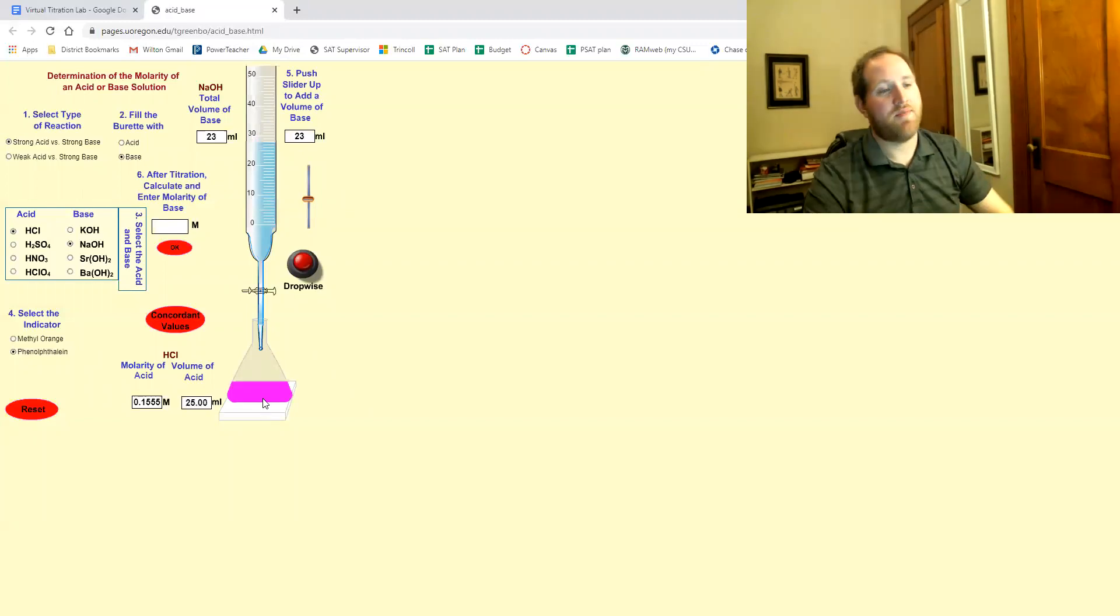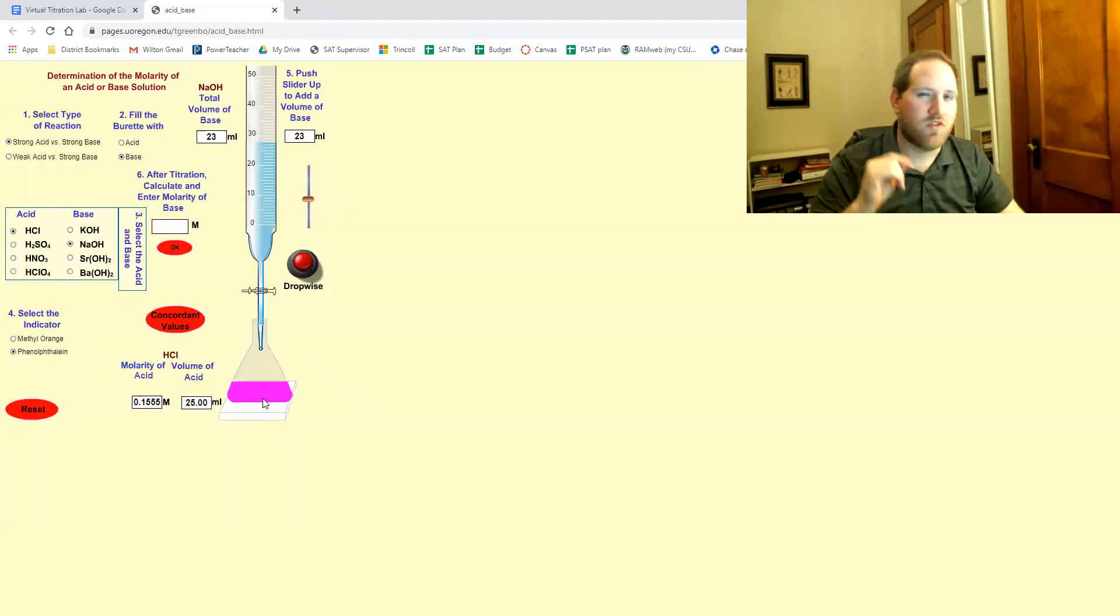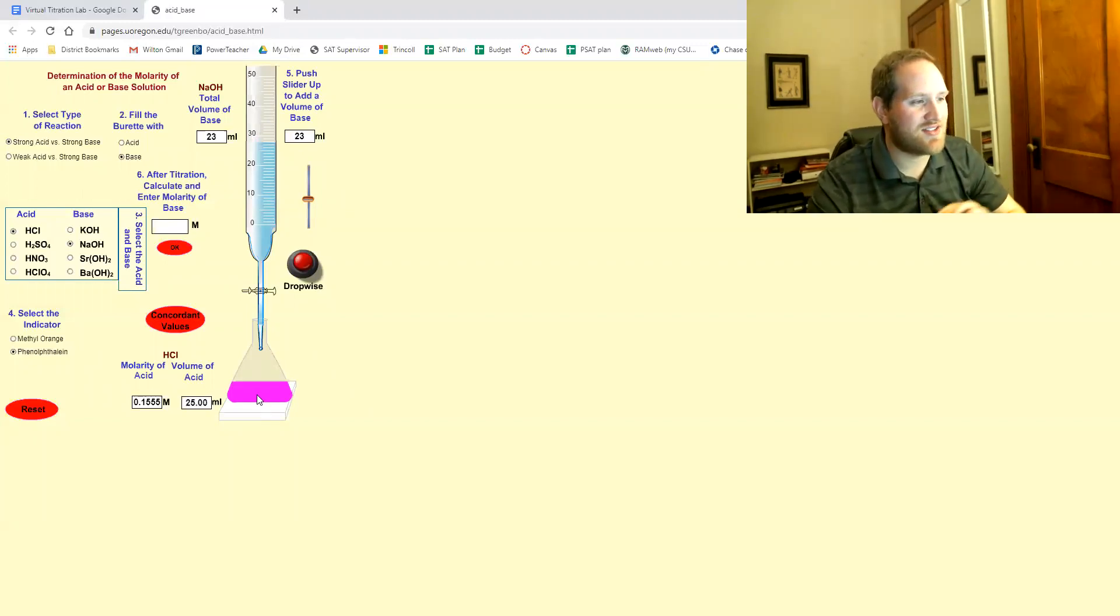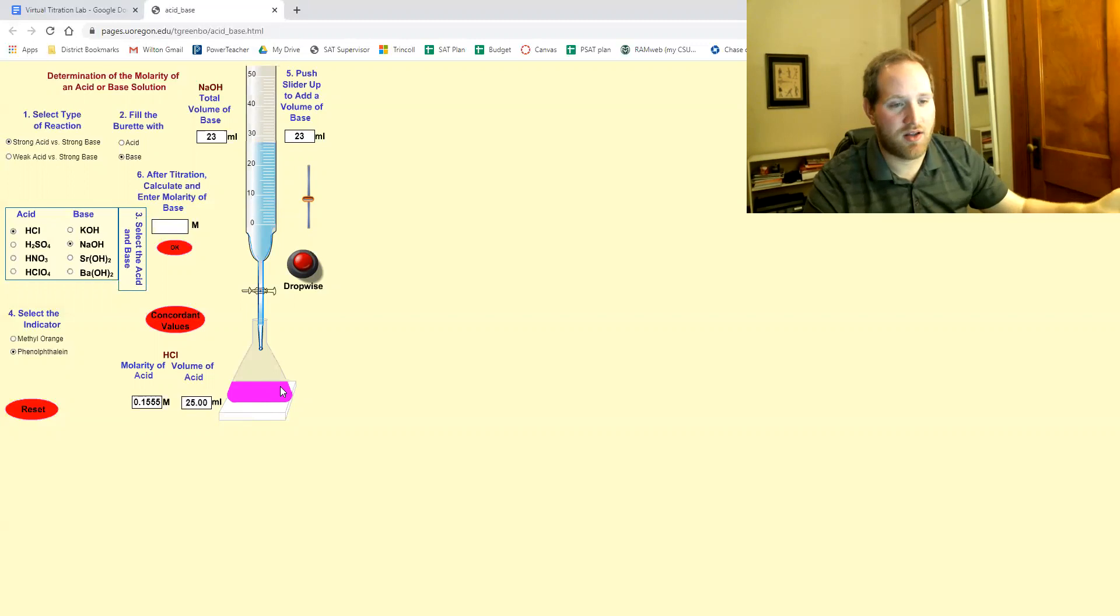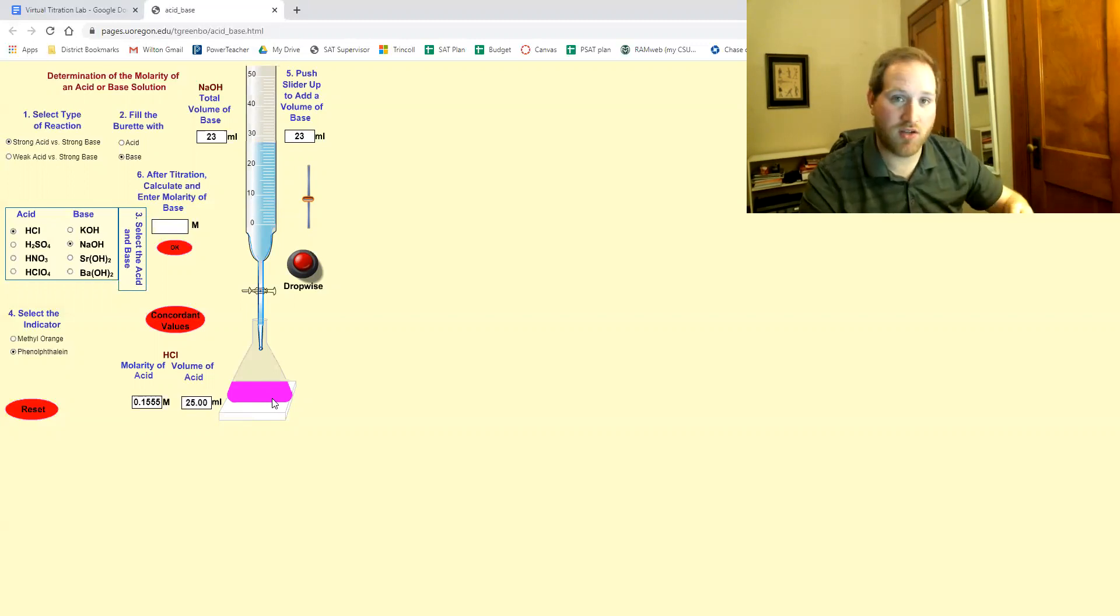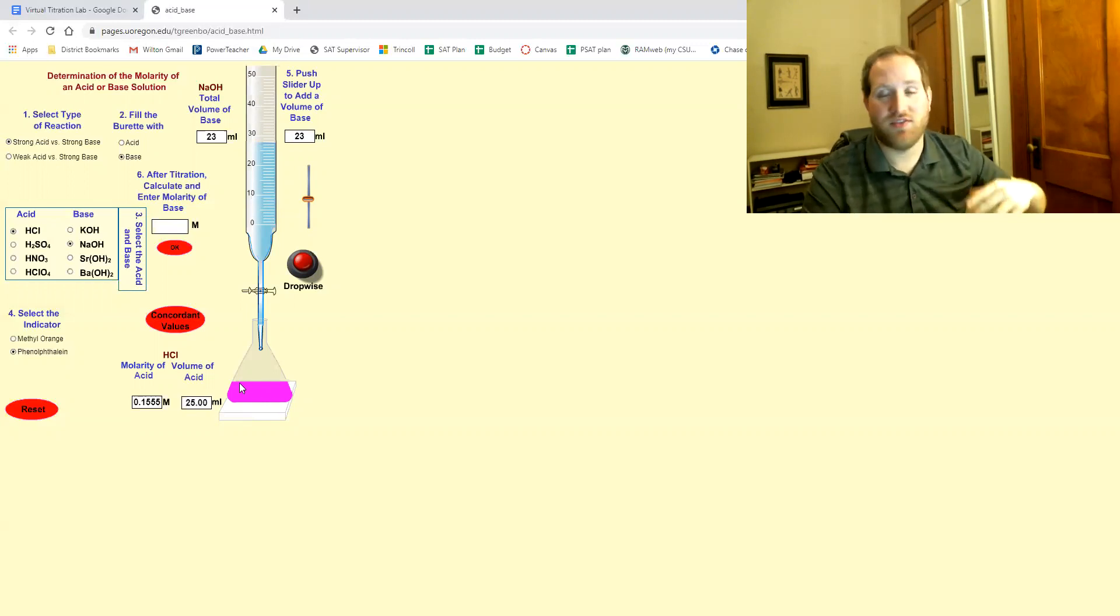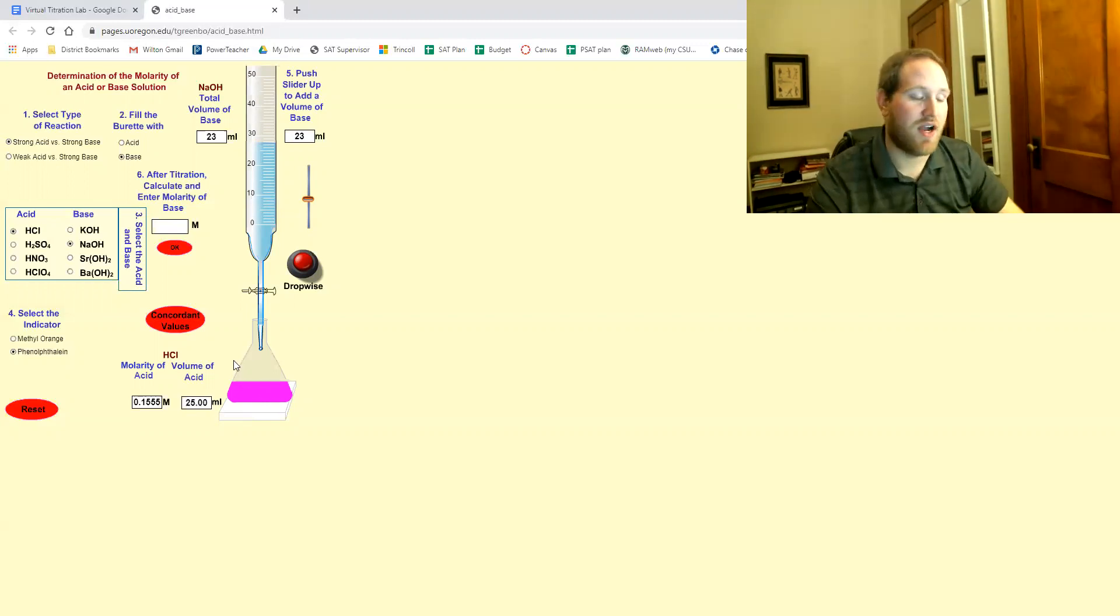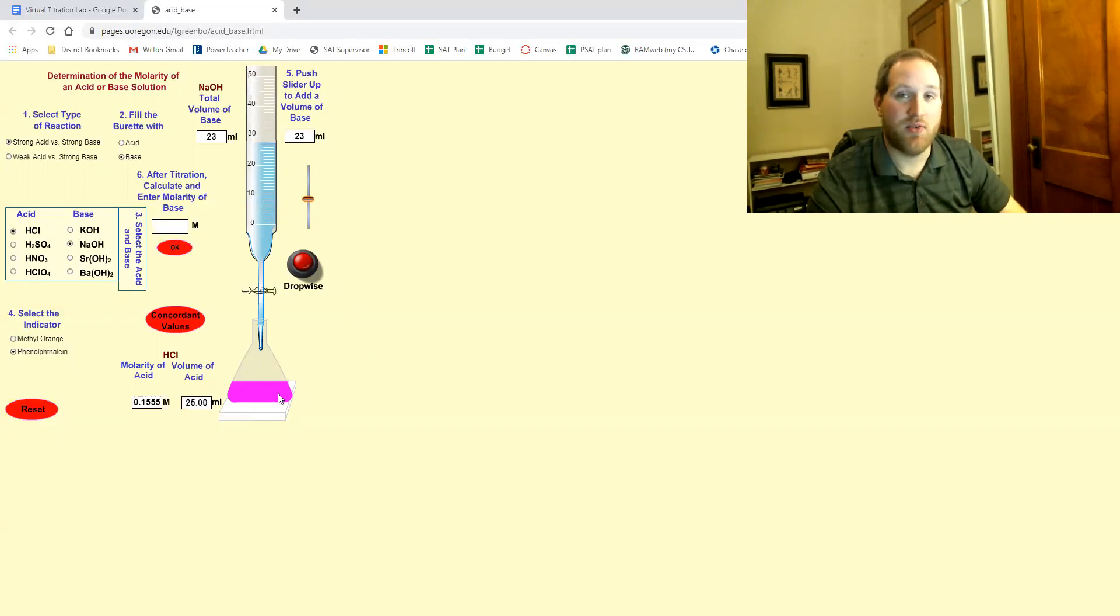See that? We overshot the endpoint. If you see that solid hot pink color, that means you did it wrong and you're gonna have to redo this trial. This happens by the way all the time in an actual lab.